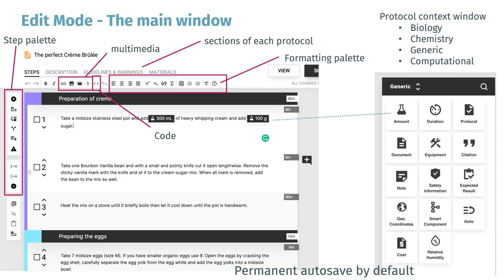I'll quickly take you through this somewhat busy slide. Below the title you see the sections: steps, description, warnings, guidelines, and materials — you just click on these and enter what is needed. Below that you have several palettes to work with: standard formatting like bold and italics, plus multimedia options for attaching files, images, video, or links. There's also an option to enter code.